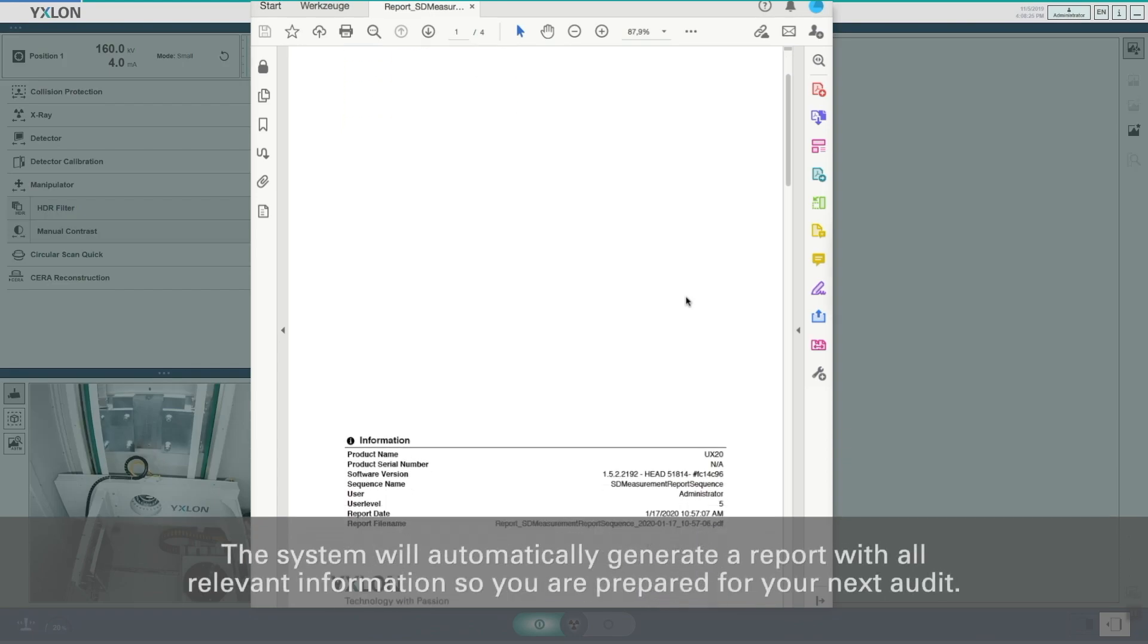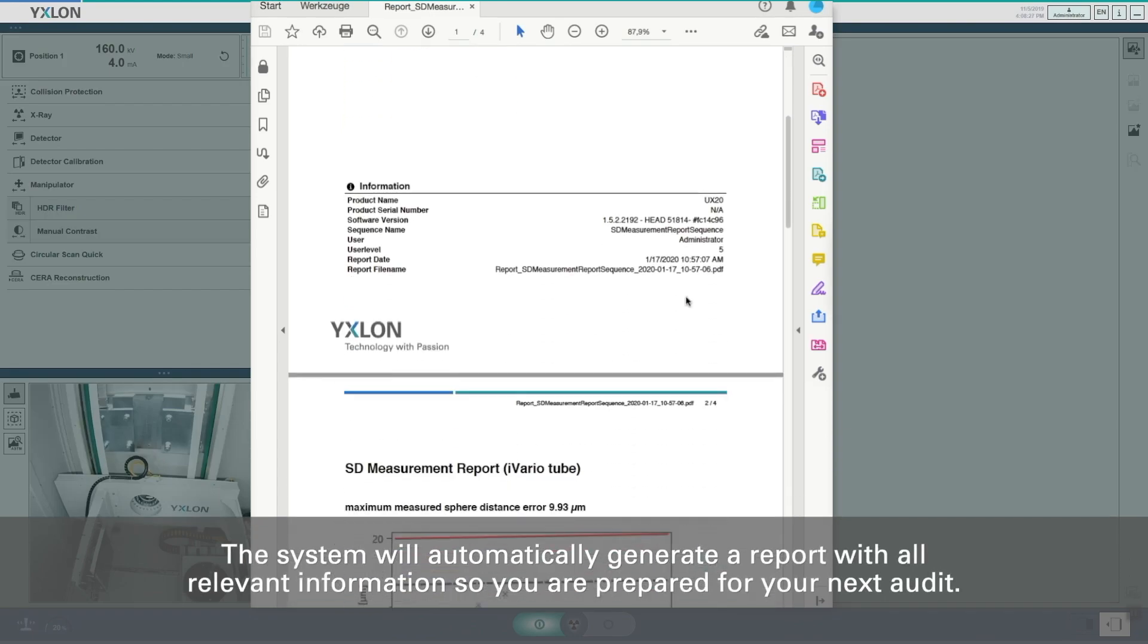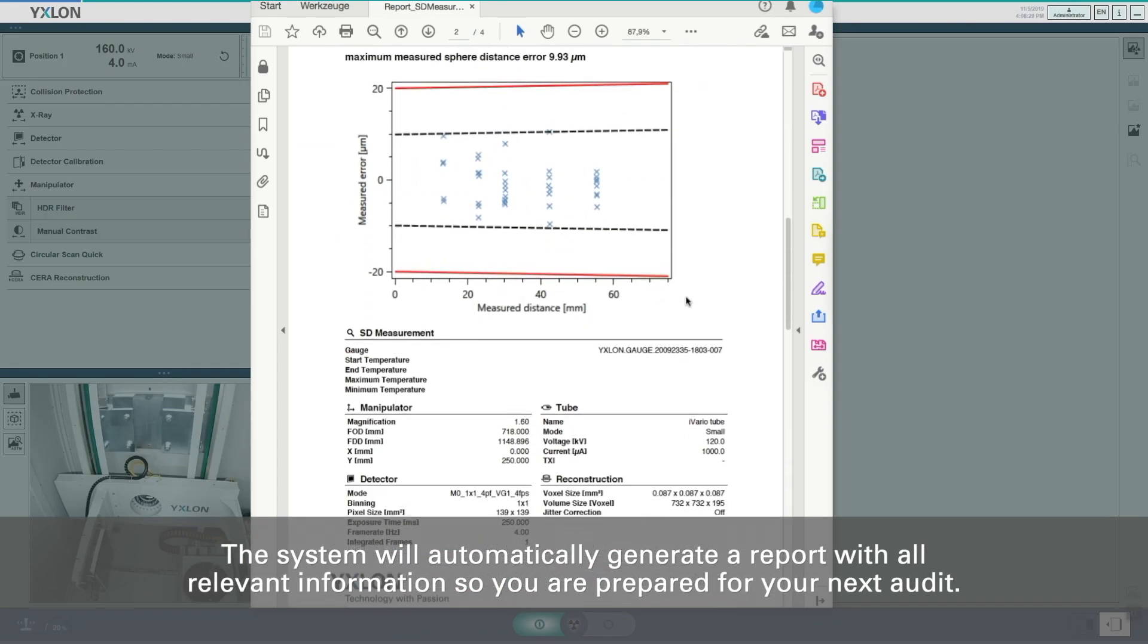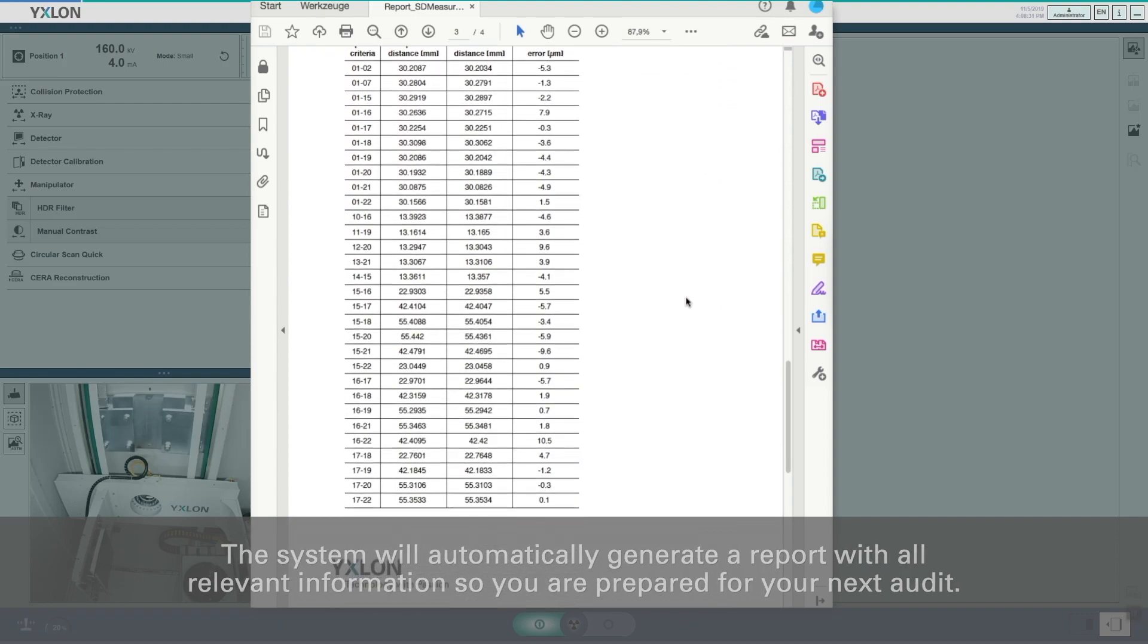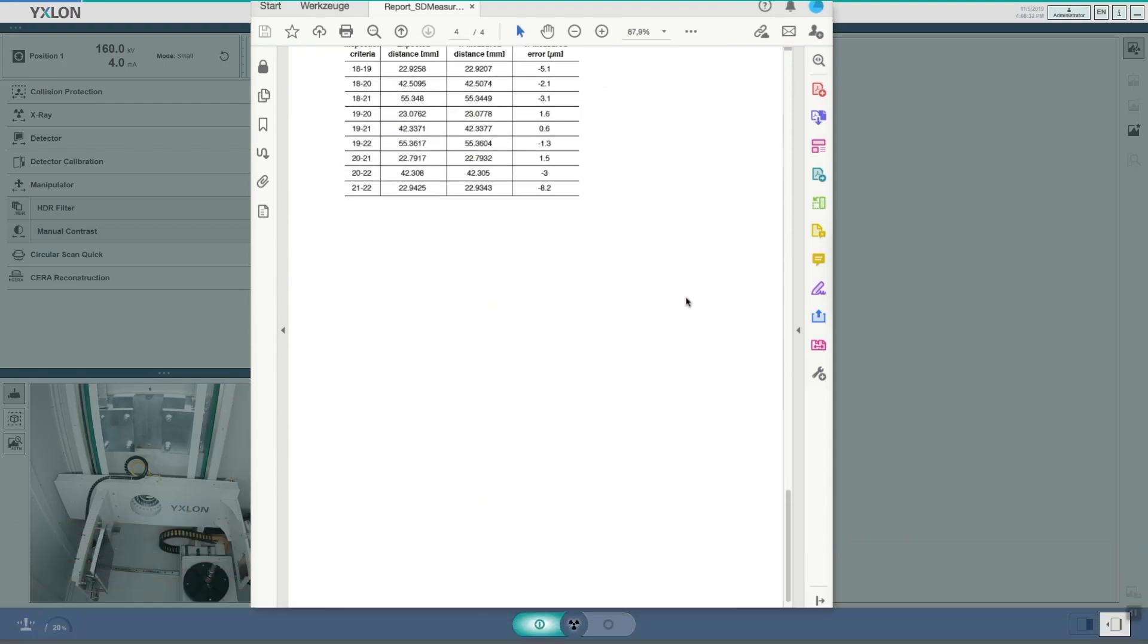The system will automatically generate a report with all relevant information so you are prepared for your next audit.